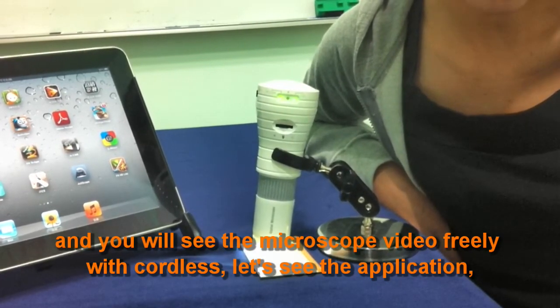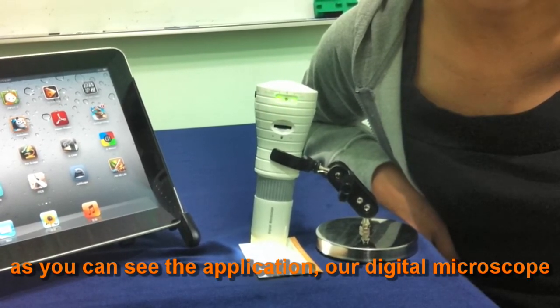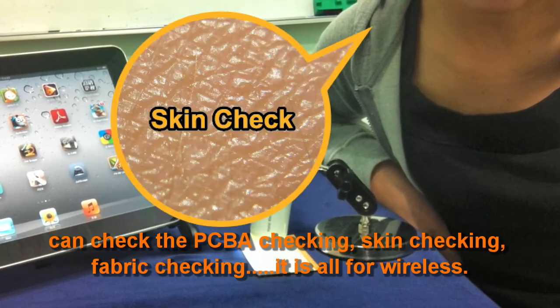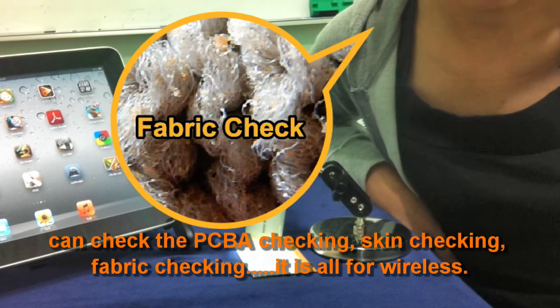Let's see the applications. As you can see, our digital microscope can be used for PCBA checking, skin checking, and fabric checking. It's all wireless.